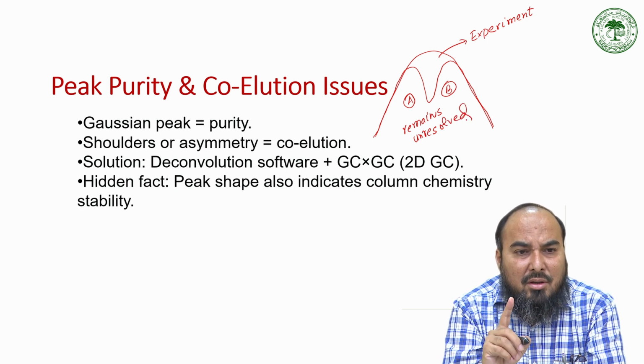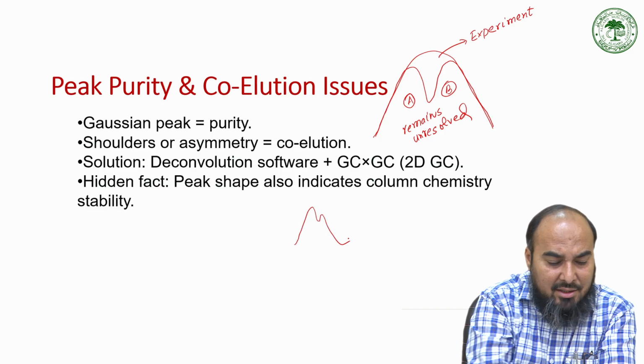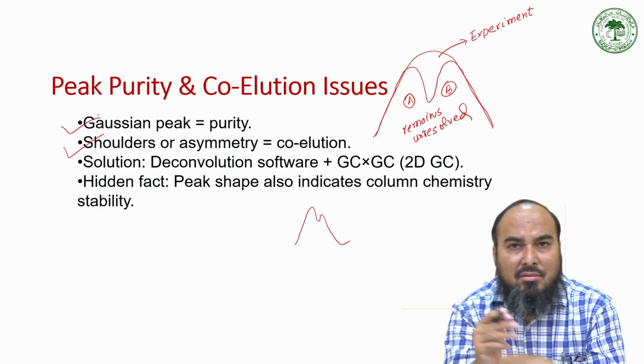So if you get a shoulder like this, then this tells you about coelution.